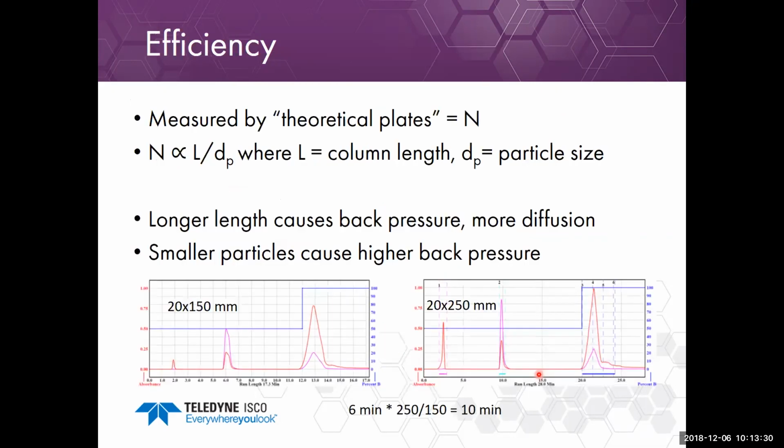The last term is efficiency. It's measured by theoretical plates.